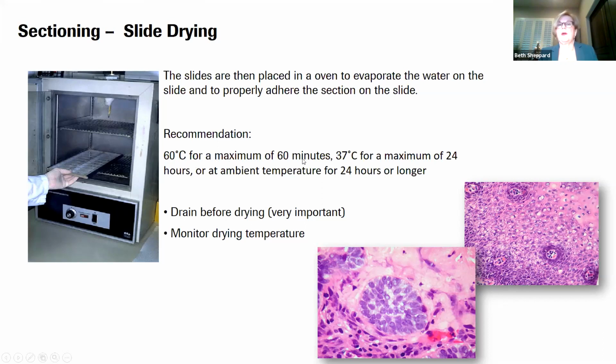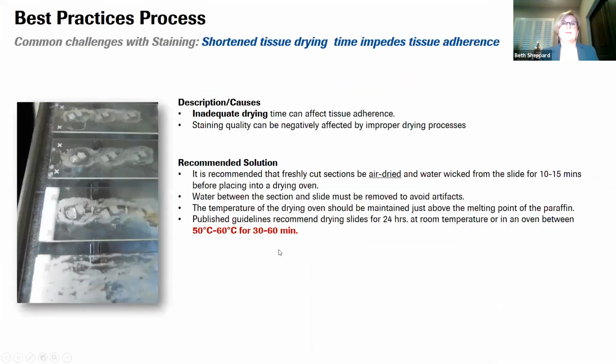This is appropriate. Higher, faster does not work, and you should monitor your drying temperature. Shortening the drying time actually impedes tissue adherence, and higher temperatures cause polymerization of the paraffin and will leave residue on the slide.